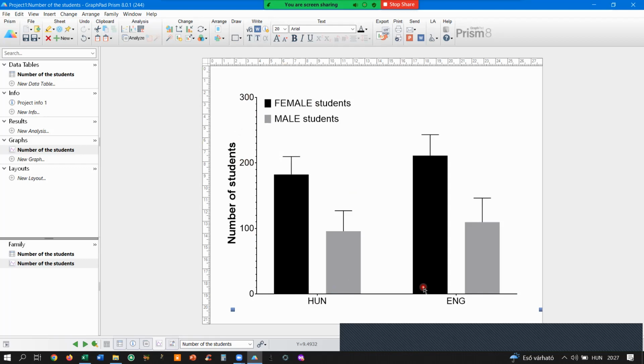However, now it almost looks like it is ready. There is one thing: the title of the axis and the numbers are too close to each other. So if you want to move the title, you need to move the cursor until this double-edged arrow appears. And when it is there, just click with the left and then move it. That's how it goes.